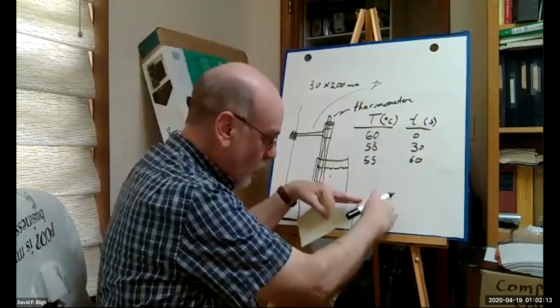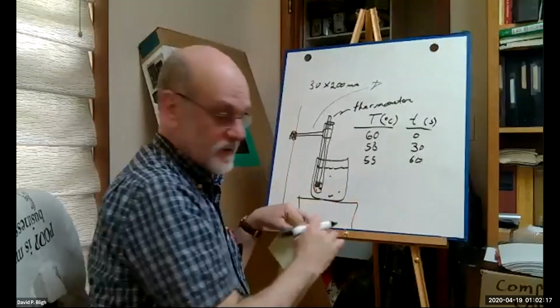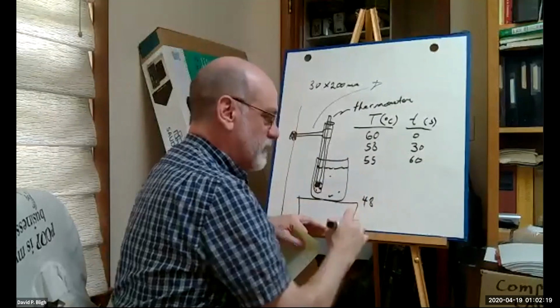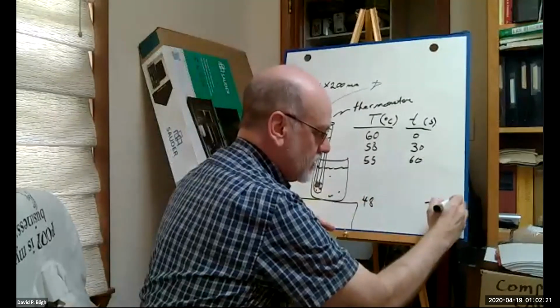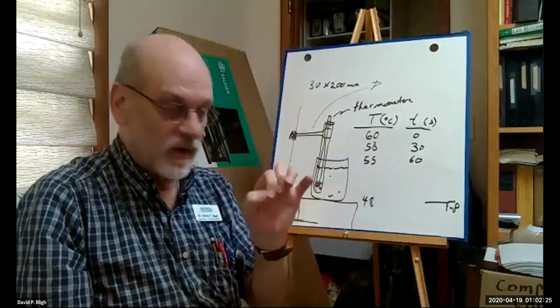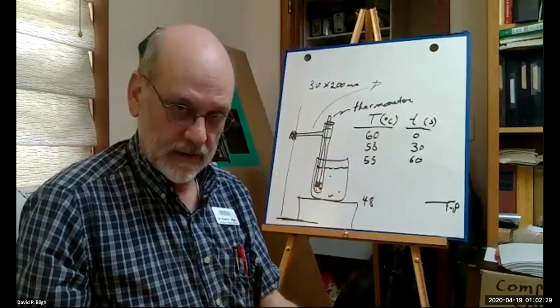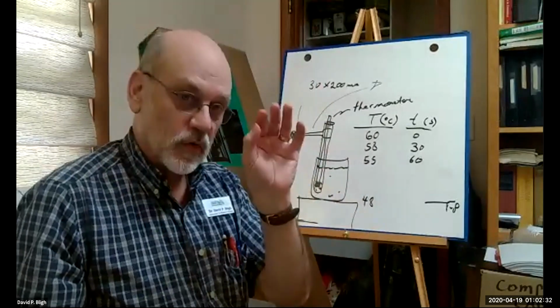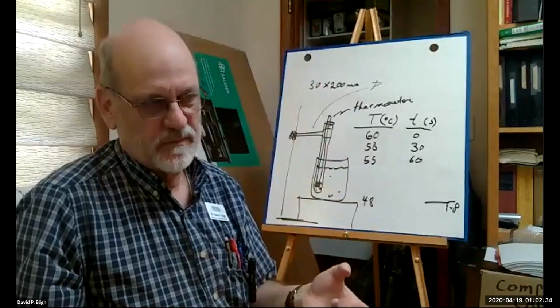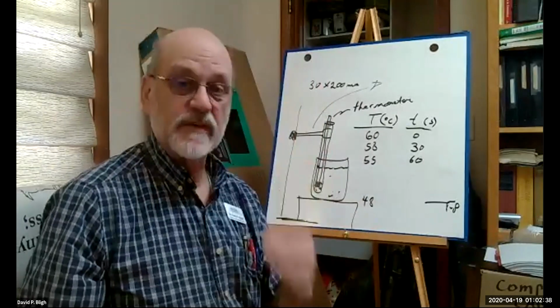And down here somewhere, at this time and this temperature, maybe 48, you find that you start to see the solid appear in the liquid. The melted lauric acid will start to show. Technically, they're not crystals, but you see pieces of solid develop.